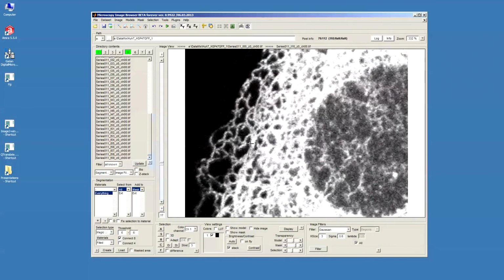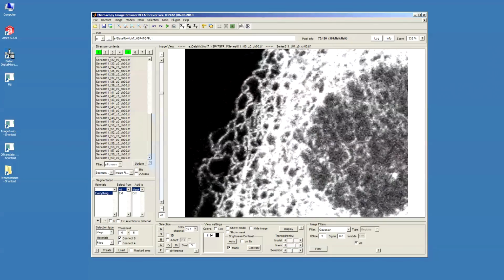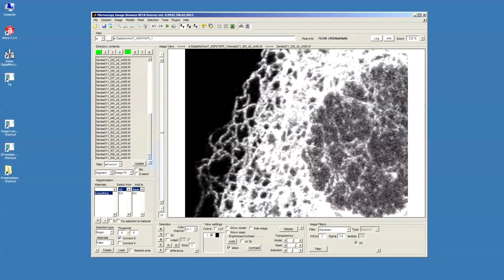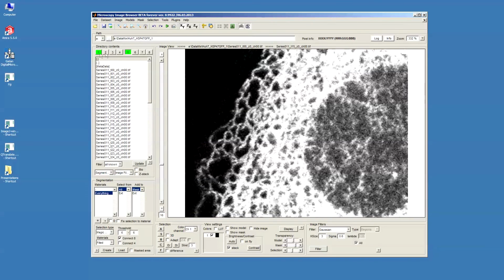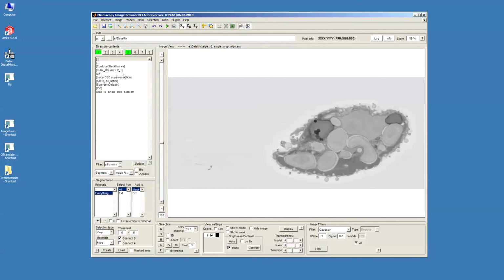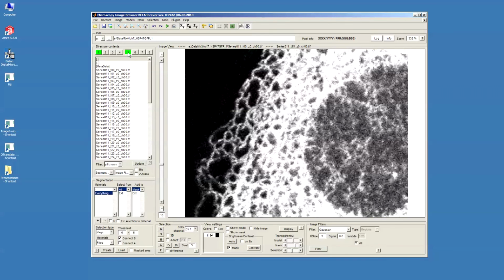So you can see that all these files that I have in this folder are now combined in one dataset. By clicking with the left mouse button on these buttons, I can swap between these two open datasets. In order to remove this dataset, I have to select this dataset first, then press the right mouse button and clear dataset.